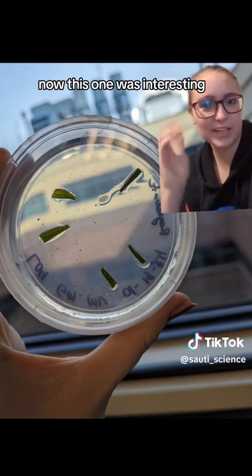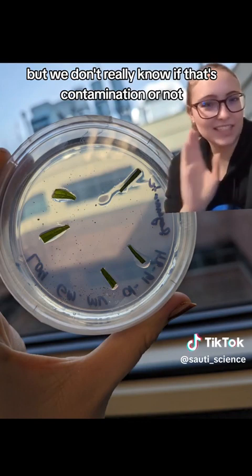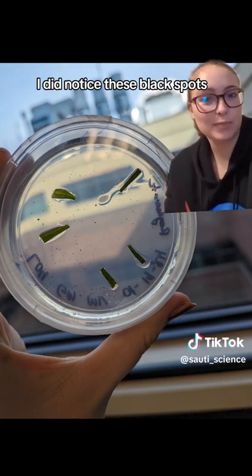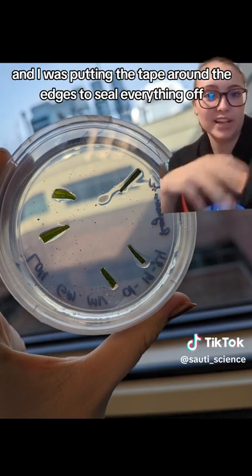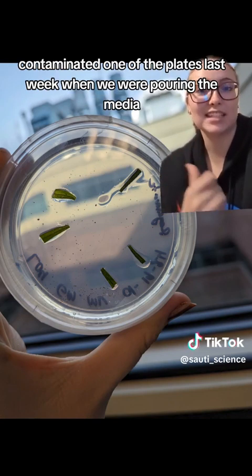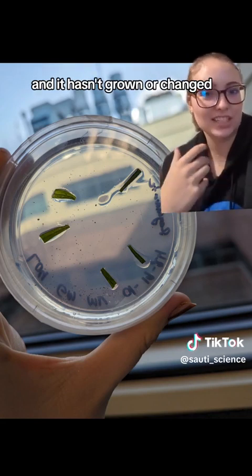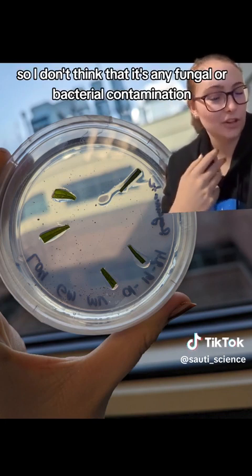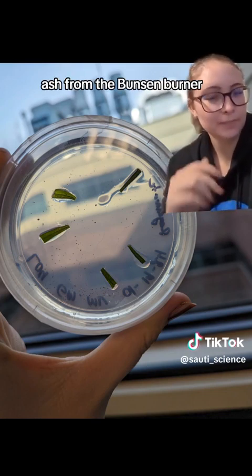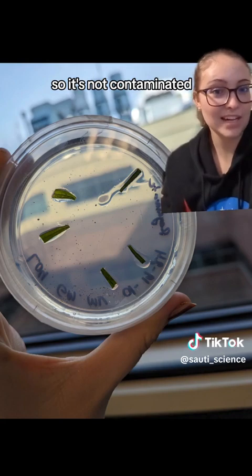This one was interesting because if you look really closely at the plate, you can see a ton of little black specks. We don't really know if that's contamination or not because there's nothing growing. I noticed these black spots last week when I was taping around the edges to seal everything off, so I thought I might have accidentally contaminated one of the plates when pouring the media. But I came back this week and it hasn't grown or changed — it's still just those little black spots. So I don't think it's fungal or bacterial contamination; it might be dirt or ash from the Bunsen burner that got onto the plate. Either way, it didn't grow anything, so it's not contaminated.